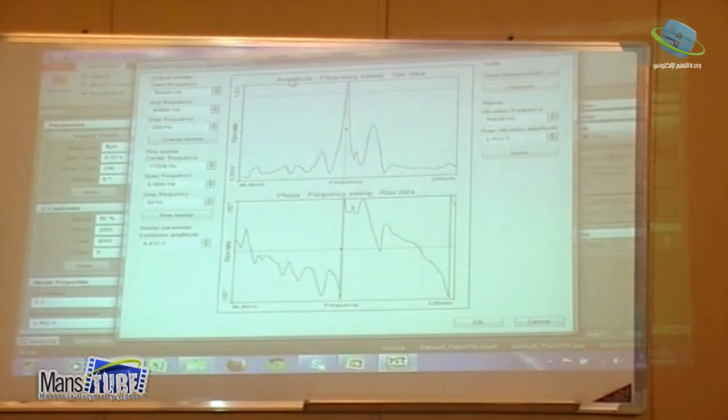Then it finds a peak and tells me, this is the peak I found. Do you want to work at that position or something else? Maybe I say, no, I need to work on this peak, or maybe this one. I can move it a little bit to the left, to a value a little bit less. You say okay, and then it will make the approach.